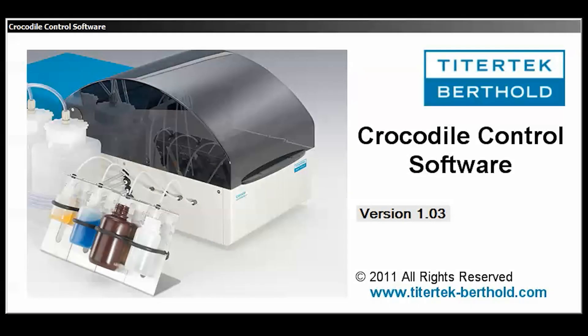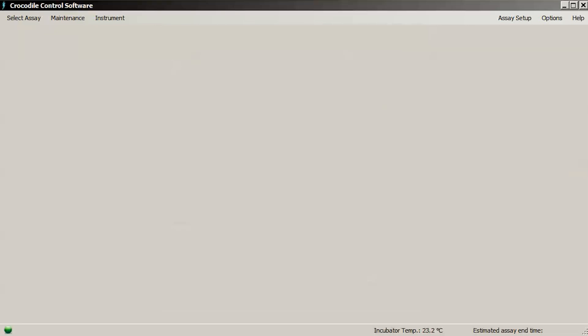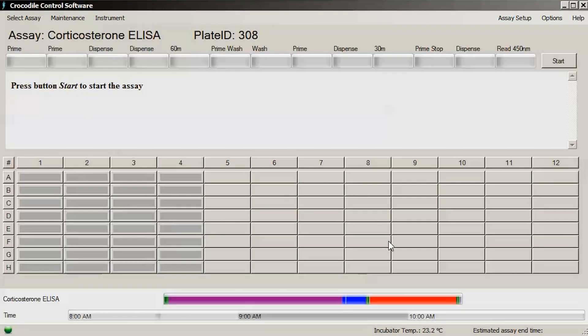With the Crocodile Control software, assay programming is quick and easy. Here we select our pre-made ELISA program for this assay. We enter the plate ID and select which wells to process. On this screen, each of our program steps are displayed, as well as the estimated processing time.